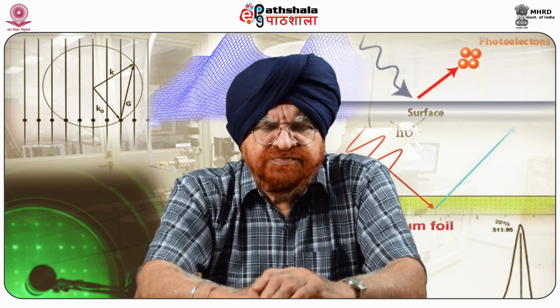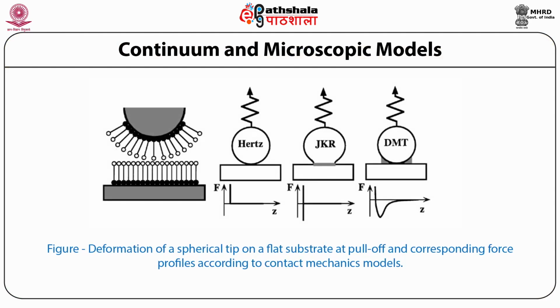Use of the JKR model to correlate adhesion forces and surface free energy also allows estimates of the number of interacting groups, which is a very important parameter. This slide gives figures which indicate deformation of a spherical tip on a flat substrate at pull-off and the corresponding force profile according to the contact mechanics model.